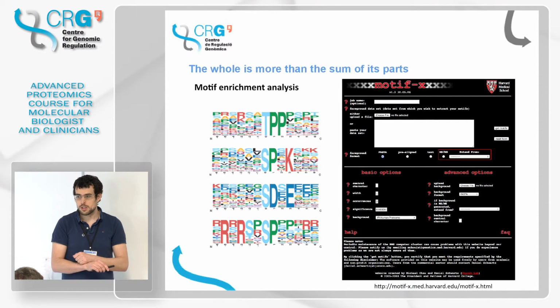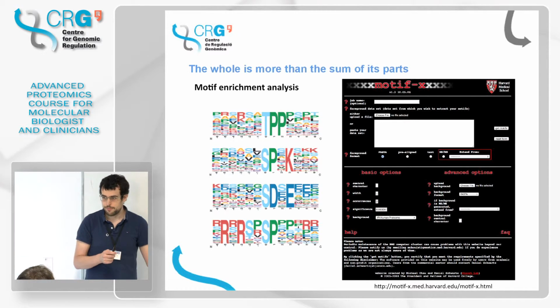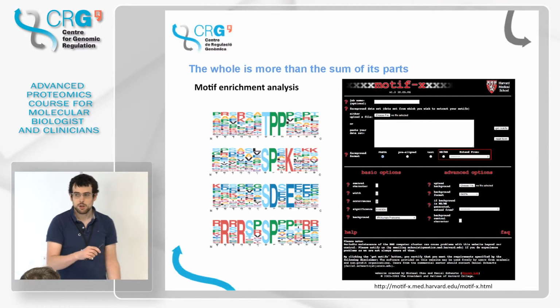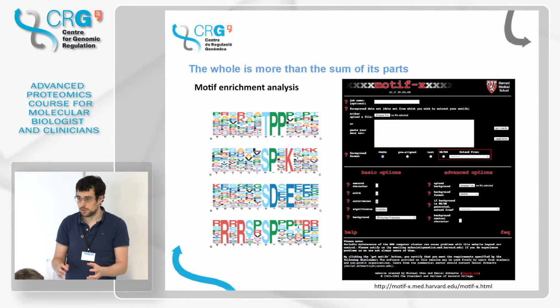And then what I would say is that actually my treatment is affecting the activity of kinase 1, 2, and 3. Okay? And I can do this with, for example, the website that I put here, which is MotifX, although there are also other ways to do this type of analysis. And this is very similar to, for example, sequence enrichment analysis of transcription factors.